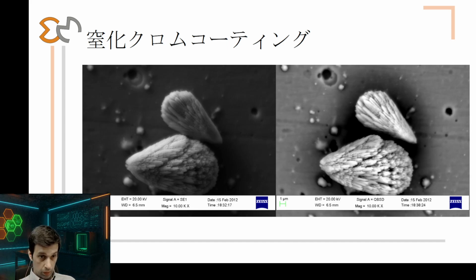In the right image, we can see that these particles are heavy, that's why they are white. We lose the idea of depth, they look flat, but we have an idea which elements are heavier, which elements are lighter.